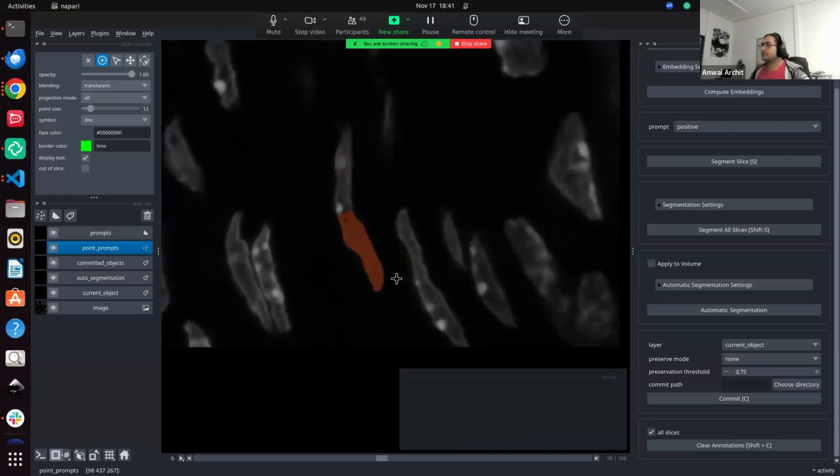Okay, slightly bad for sure. But then we put a rectification point and segment all the slices again. And this is how you can improve the segmentation using, hopefully, a few clicks. In this case, the contrast of the object is not so great to do the segmentation with a few clicks. But then this is where the fun begins. If the model does not do a good job on your data, you just have to annotate a few planes, since the training is in 2D only, and then retrain your own model. This natively would be a great segmentation experience for your task.